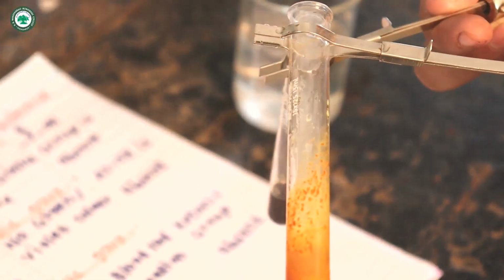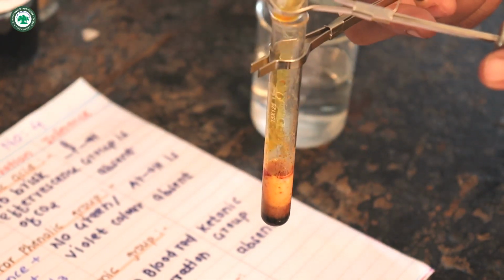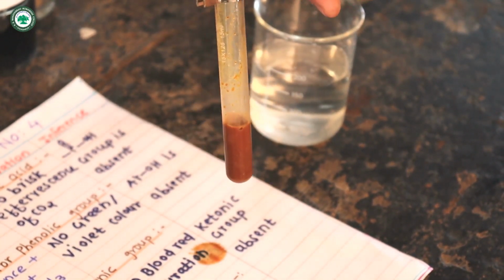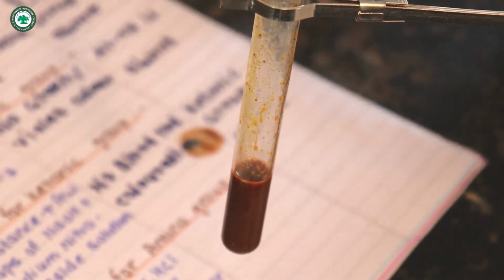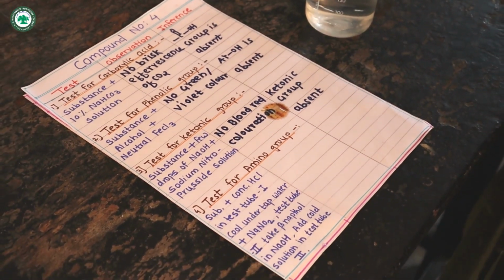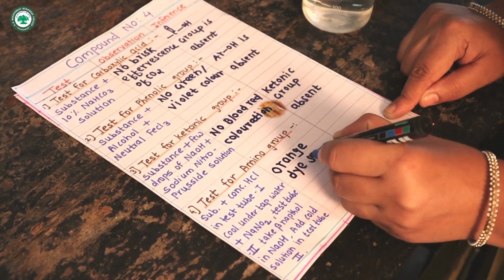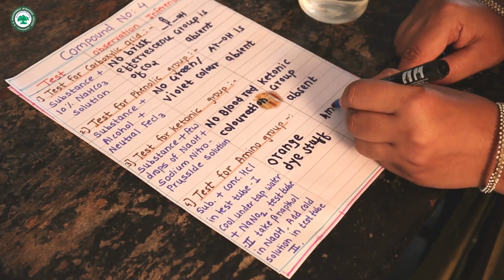If an orange dye appears, therefore functional group of compound 4 is amino group. Amino group is present.